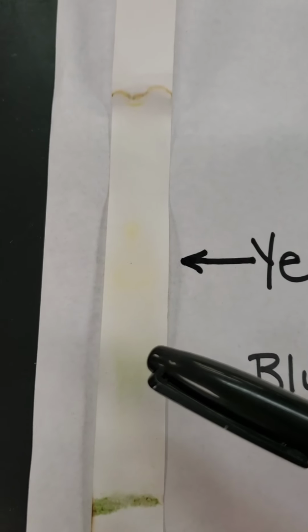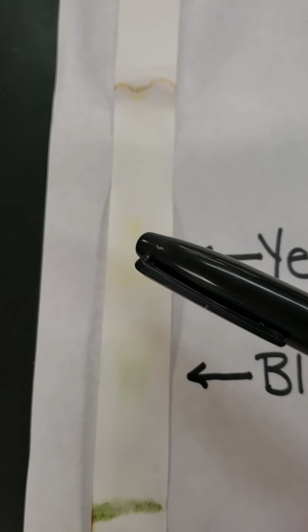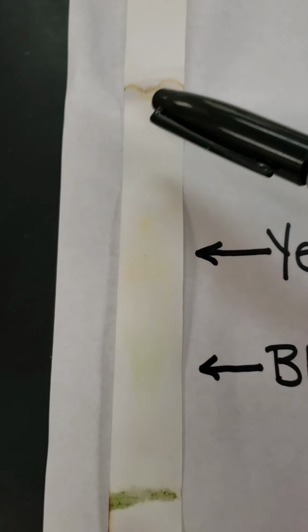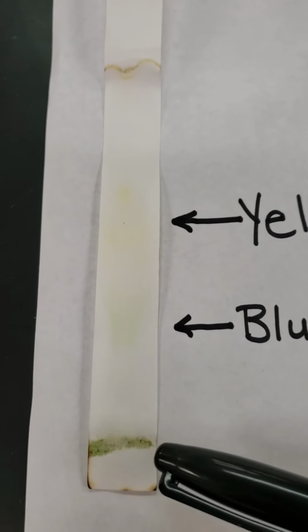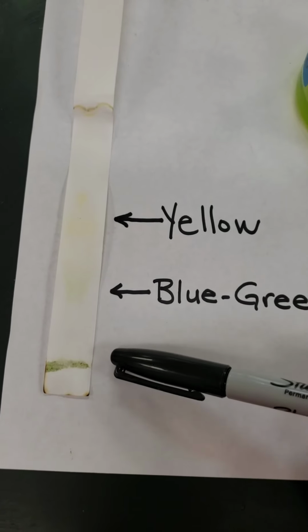Blue is a heavier pigment, heavier chemical compound than the yellow. So the yellow could travel further with the alcohol. The alcohol ended way up here. There's nothing up here. So this just shows you the different pigments that are found in chlorophyll.